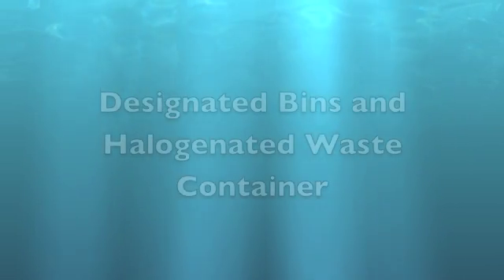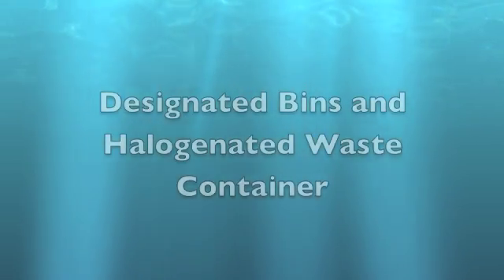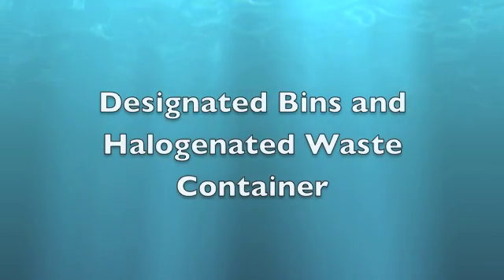Your components should be placed in their designated bins and all of the filtrate solutions and any HCl solution leftover should be placed in the halogenated waste container.